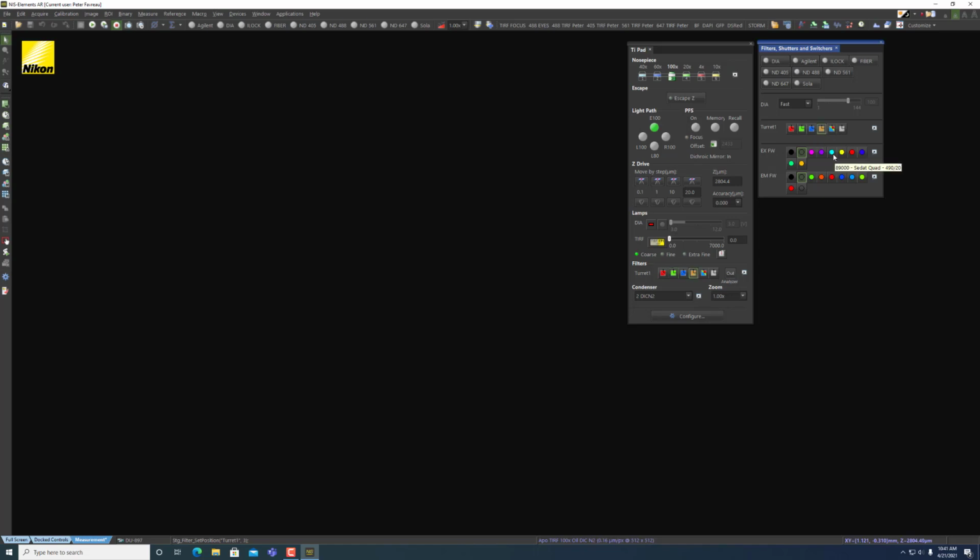And then I want to select the filter that is closest to the peak excitation wavelength of GFP. That just happens to be around 490, so I'm just going to select that. The peak emission wavelength of GFP, I just happen to know off the top of my head, I think is like 502 or 510. So we would want a center wavelength around 510. There's a 525 here, which is pretty good. And so if I use this filter setup, I should see pretty much the same thing as if I just selected the GFP filter cube on its own.